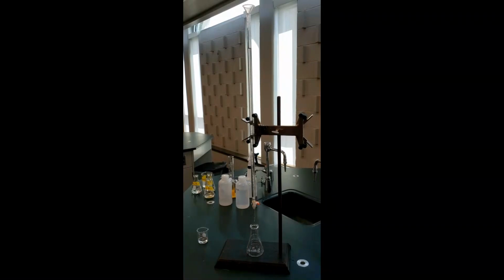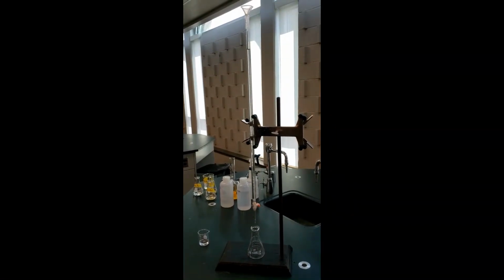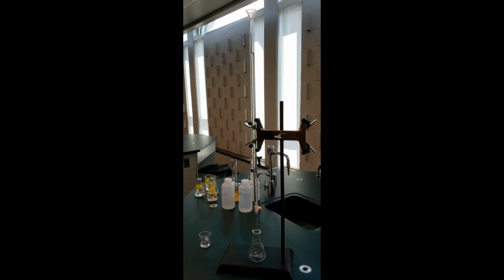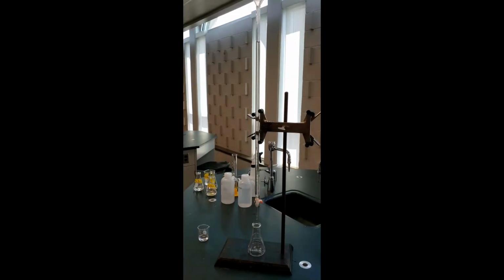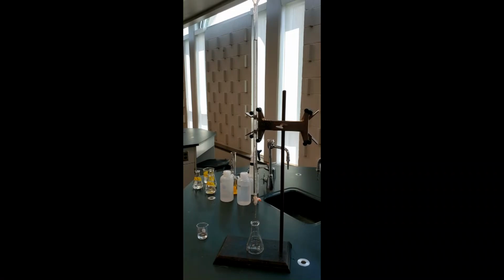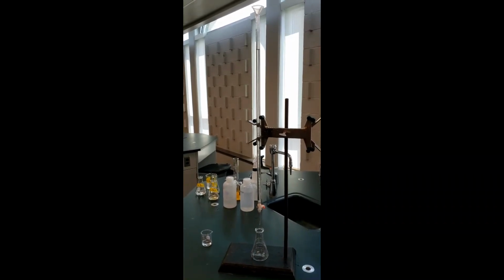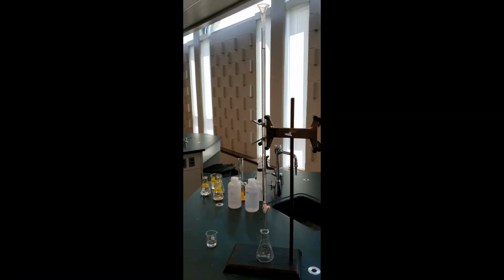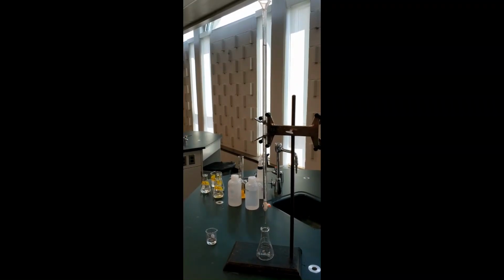Here is the entire titration setup. At the top you can see the burette funnel, the little plastic funnel for filling the burette. The burette is the long glass column. At the bottom is the Erlenmeyer flask. It's empty right now, and in the burette right now is distilled water. So I'm going to show some things that you can do for the technique. And in that beaker on the left is distilled water right now, but that's going to have the sodium hydroxide in it.